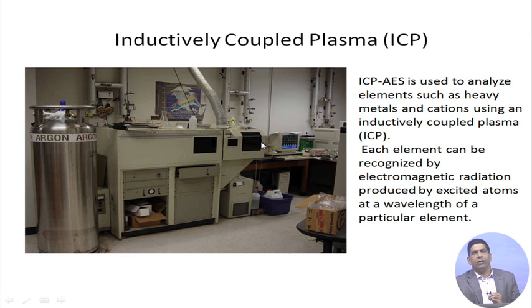The samples are injected through a nebulizer into this chamber, and there things get excited.